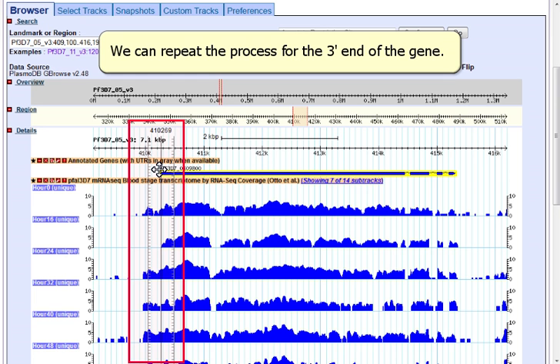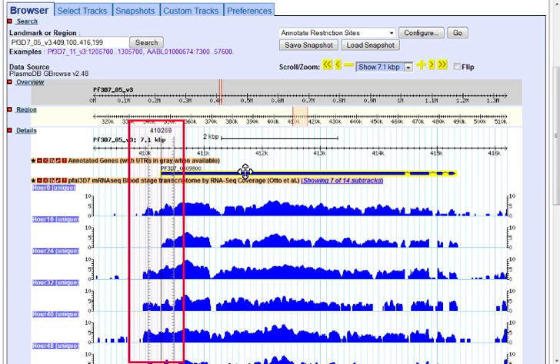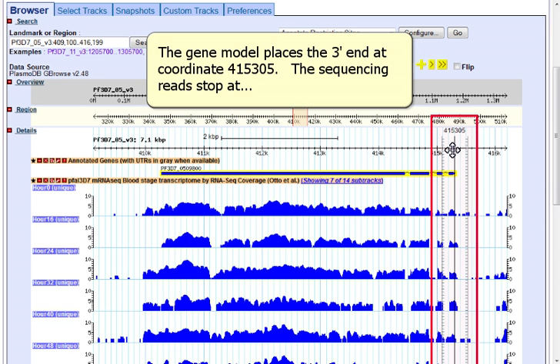We can repeat the process for the 3' end of the gene. The gene model places the 3' end at the coordinate 415,305.